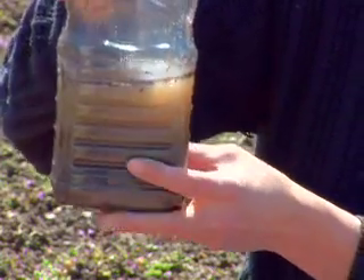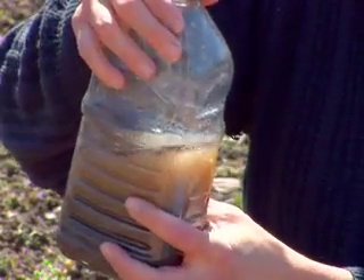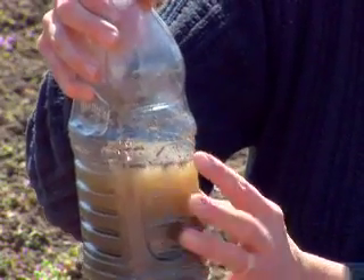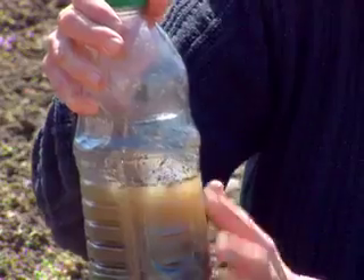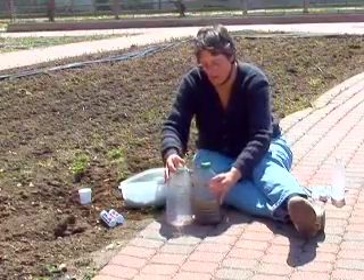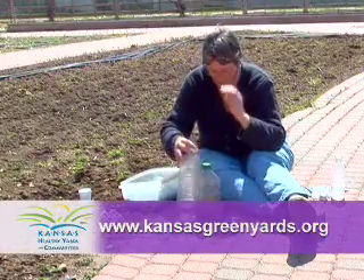The water is starting to clear, and at the same time I can look at the surface of the water and see the organic matter floating on top. This will tell me a little bit about the health of my soil and the organic matter content. These are the first tests I would run as a home gardener on my soil at home.